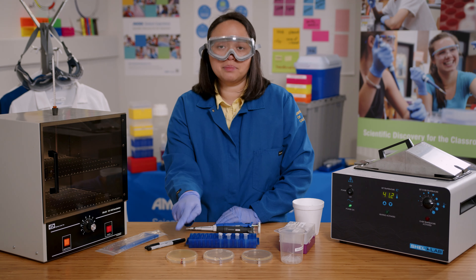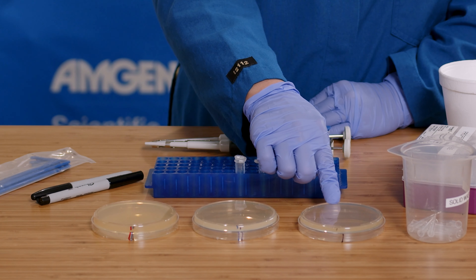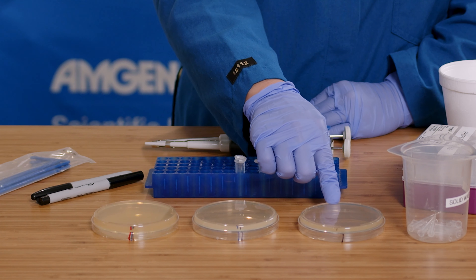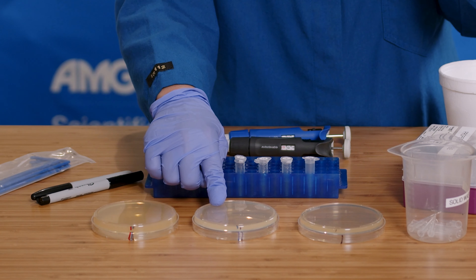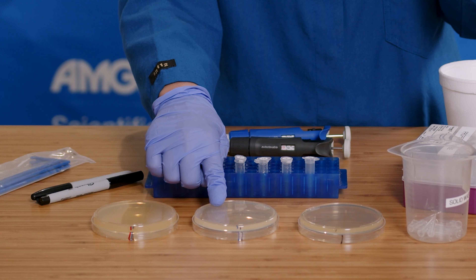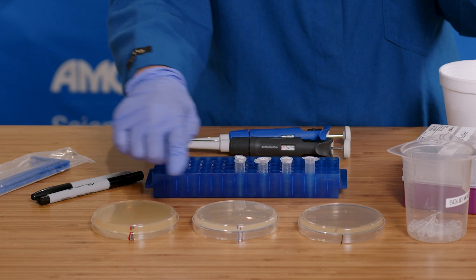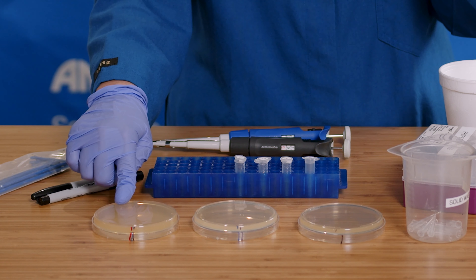For this lab, there are three different plates. The plate with one stripe has just LB and has the nutrients the bacteria need to grow. The plate with two stripes has LB and ampicillin — the ampicillin should prevent the growth of any bacteria that don't have the ampicillin resistance gene. The plate with three stripes has LB, ampicillin, and arabinose. The arabinose is needed for the red fluorescent protein to be expressed.